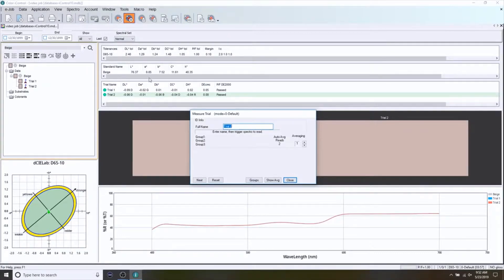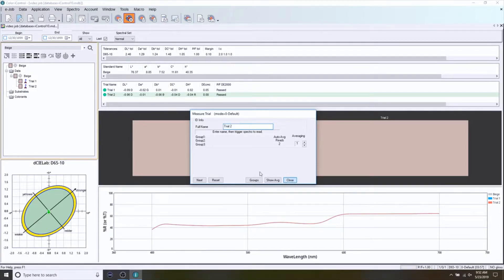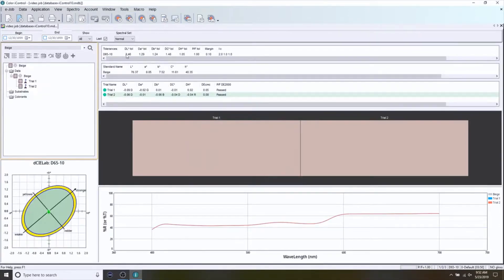We can see the delta values for those trials against that standard. That's the best kind of situation — hopefully all of your production goes that well, but it's maybe not reality that color is always that close. So we're going to do another standard and trial and talk about some of the different ways we can do this. Again, we're going to be creating a standard — back to our target icon.